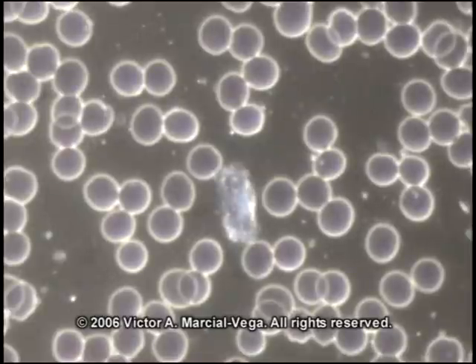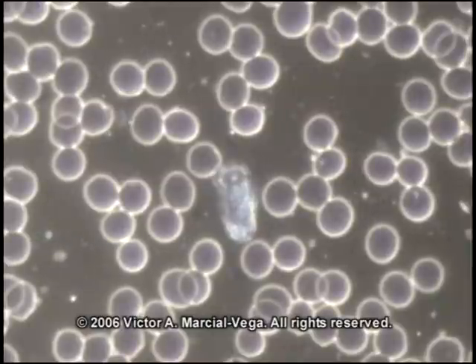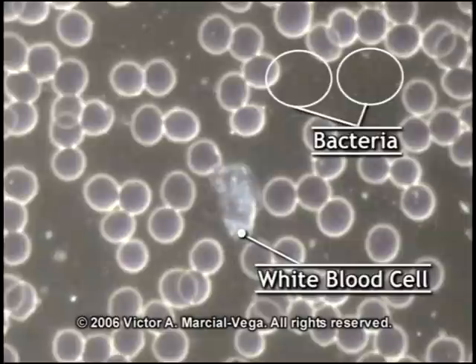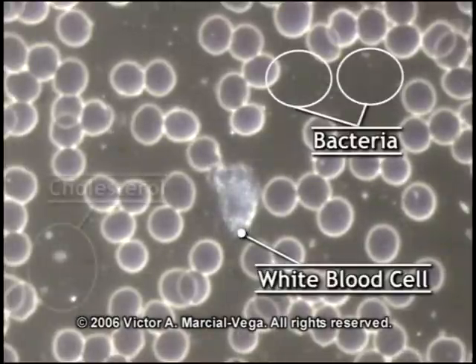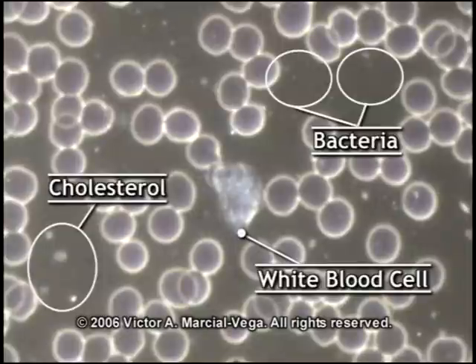The cells have separated, meaning the blood is becoming more alkaline. It's transporting oxygen better. That's why they feel better right away. They're oxygenating better immediately. The bacteria floating in the background, they're still there, but it's better. This is a white blood cell in the center. It's moving up and it's becoming wider. This white blood cell is starting to wake up. It's supposed to move across the blood, eat the bacteria, eat the cholesterol pieces, recognize what's supposed or not supposed to be there, and have a good time, of course.